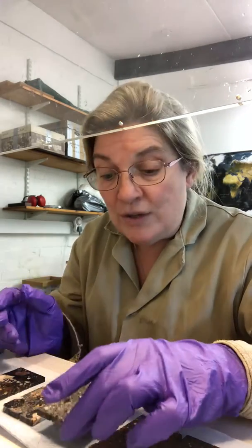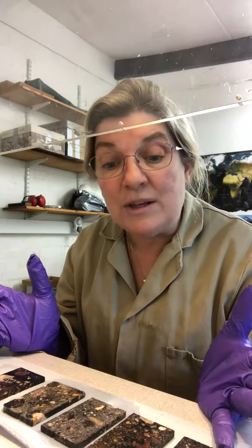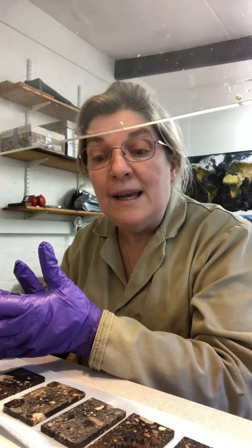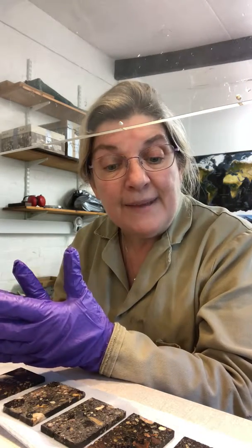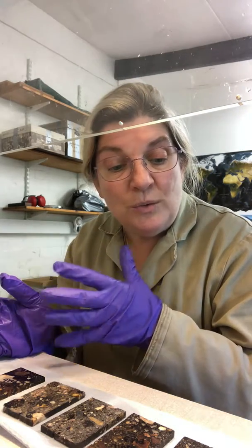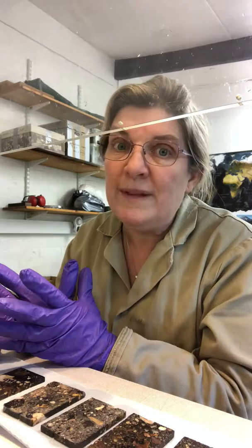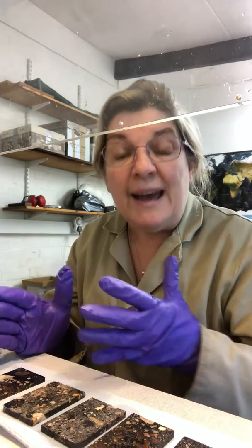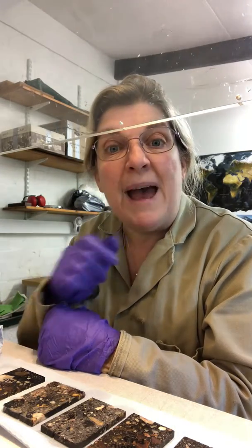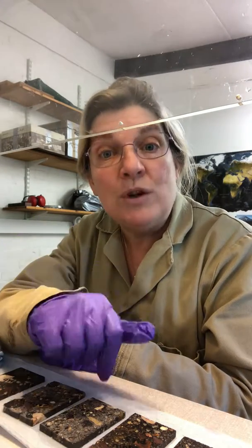So that gives me a lot of confidence now that we can, after 24 hours pretty much, clean our sample slices, clean our glass by the same method of flooding, and then we're going to get ready to mix our resin and to put our sample slices on the press. So I'm going to turn the camera off. This is the end of part 1, because I need to turn the fume cupboard on before I finish my cleaning. So we'll be back in a minute, and we're going to go through the recipe we mix to mount our sample slices.